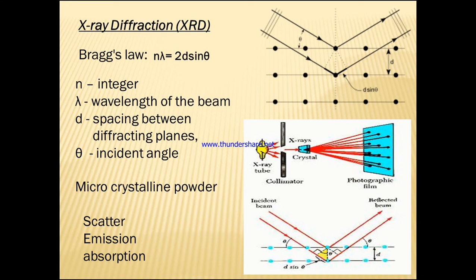So the X-rays are produced whenever high speed electrons collide here. So when we are going to see a collision or bombardment between the electrons which collide with the material target, when it takes place, so by the radioactive source we can have a production of X-ray emission here. So these X-rays which are being produced with high speed electrons, when the high speed electrons collide with the metal target, the X-rays will be produced. These X-rays are used for the purpose of the analysis of the material here. So that is what we are having.